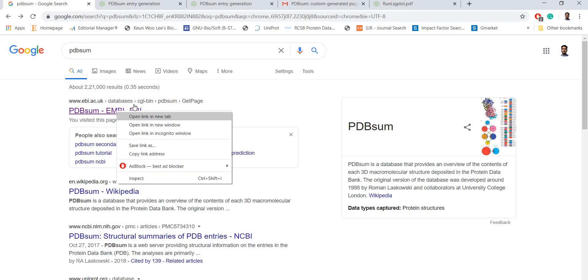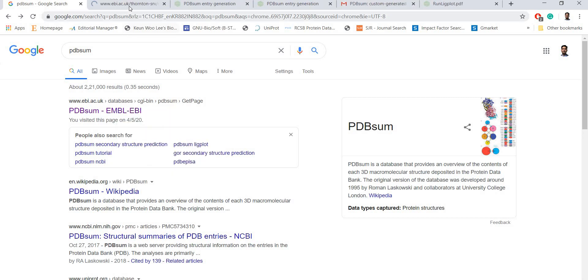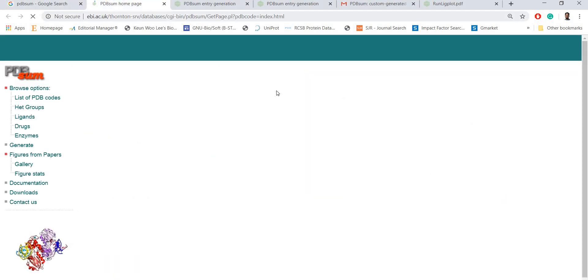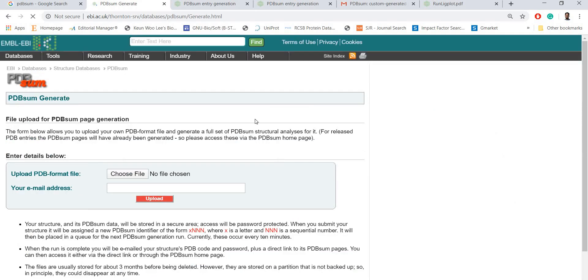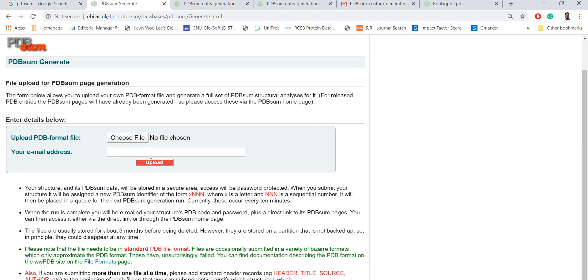You need to go to generate if you want a custom search.